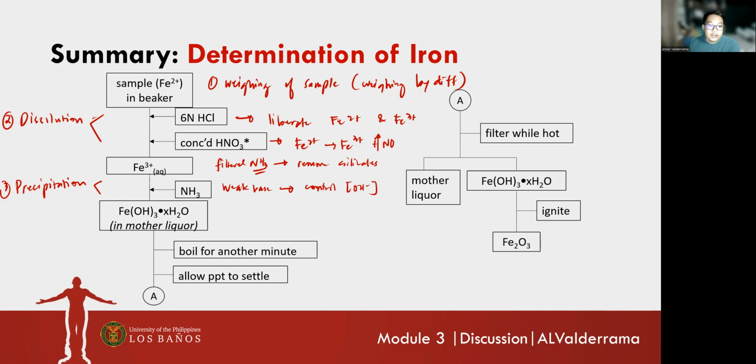Okay? So after precipitation, we'll have digestion. So digestion for exactly 1 minute to promote crystal growth or particle growth via coagulation.